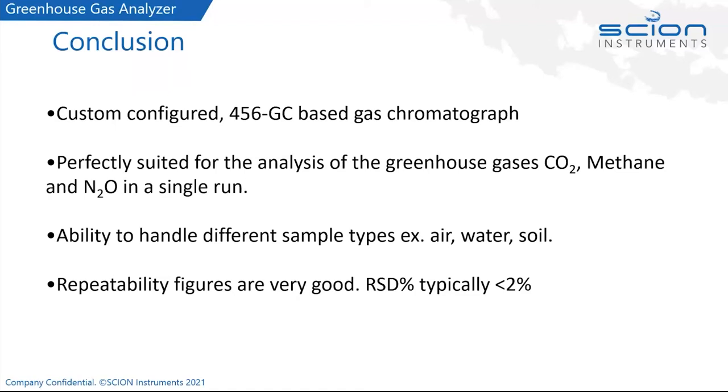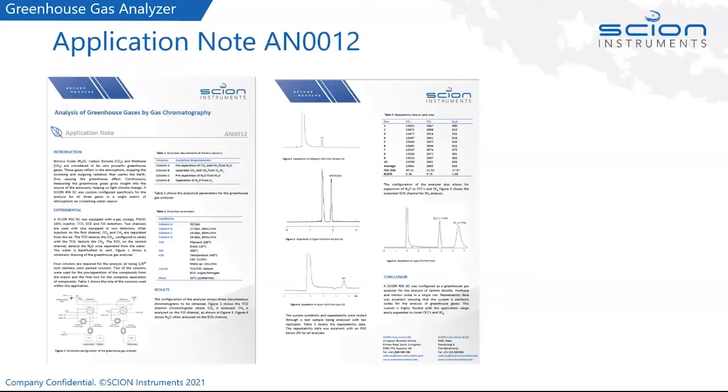The application note can be found on our website. It's application note AN0012. In there, you will see the same as I just discussed, with the examples, the repeatability data, and also the conditions. So you can have another look at this and see if this is applicable for what you need.